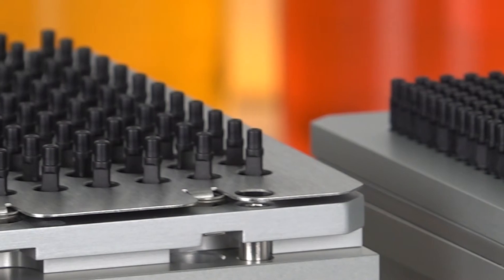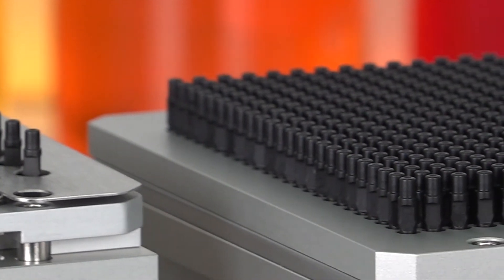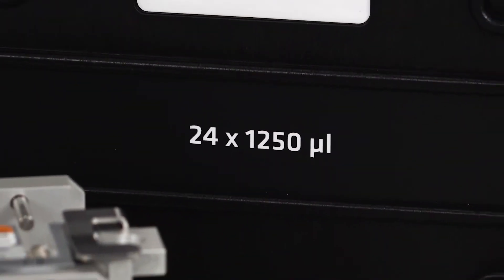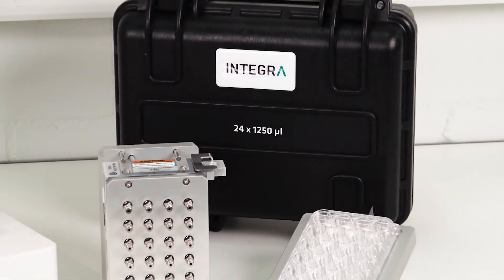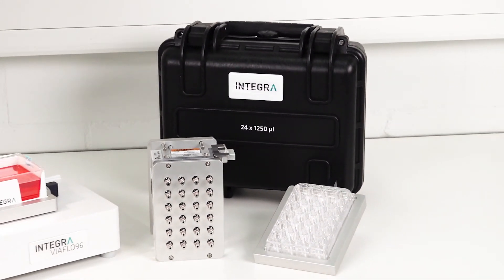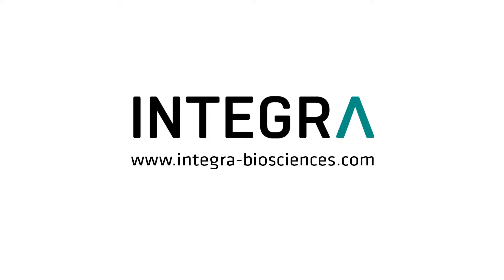In addition to 96 and 384 channel pipetting heads, the 24-channel pipetting head is yet another tool to boost pipetting productivity in your lab. For more information, visit our website.